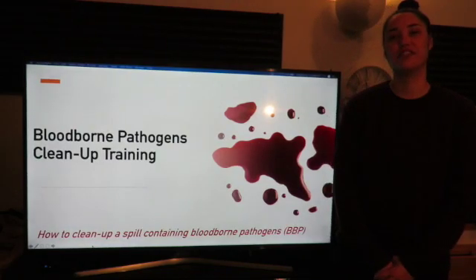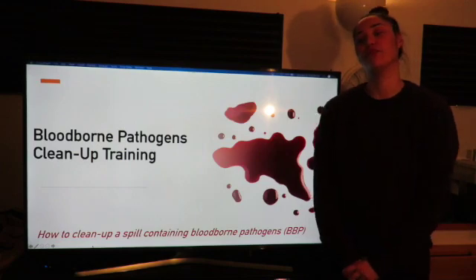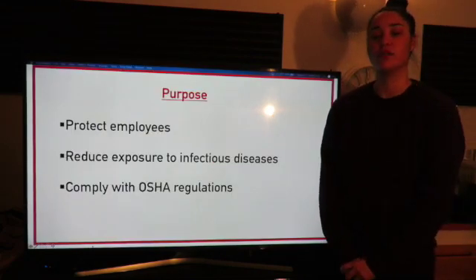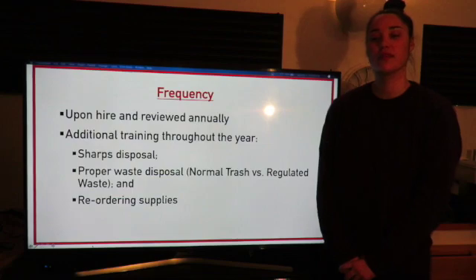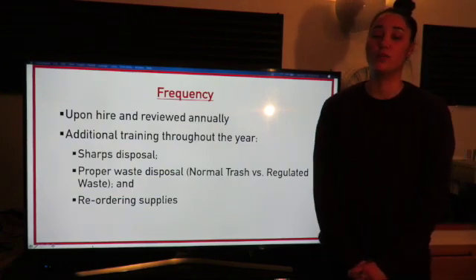Welcome to your bloodborne pathogens cleanup training. This training will teach you how to clean up a spill containing bloodborne pathogens. The purpose of this training is to protect employees, reduce their exposure to infectious diseases, and comply with OSHA regulations. Employees will receive this training when they're first hired, and they will review it annually.